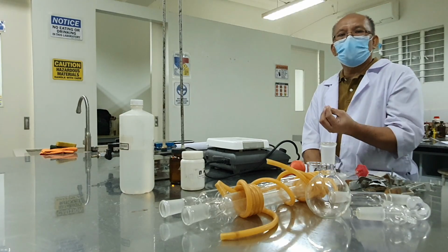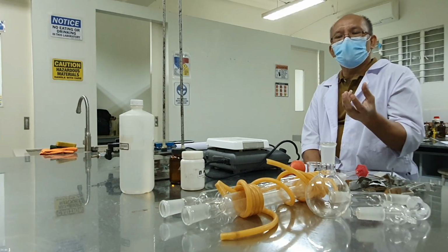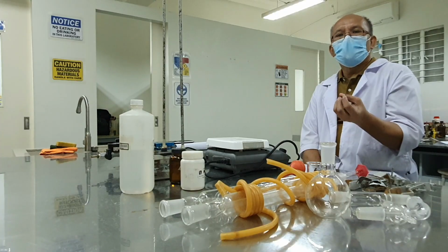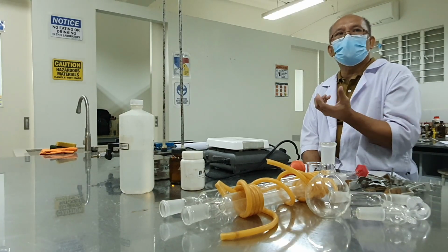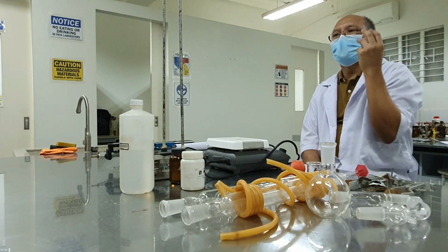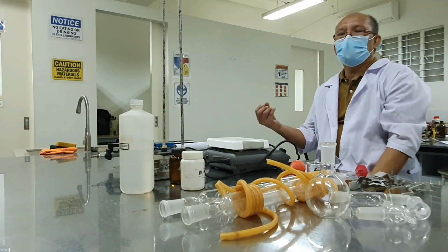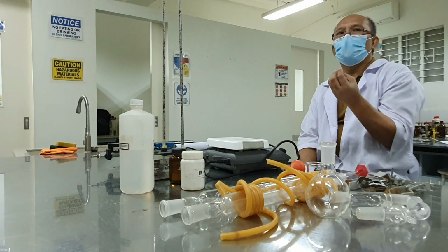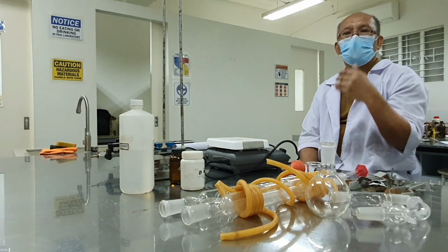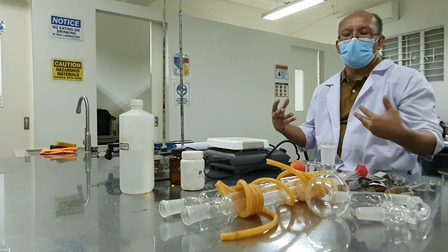So when you heat the mixture, you are evaporating, you are increasing the temperature, so you increase the vapor pressure of the mixture. The lower boiling point will evaporate first, and if you cool it somewhere, that vapor will condense into a liquid, and you collect that. In order for the vapor to become a liquid, we have to lower the temperature, so we use what you call a condenser. The whole setup is what you call the distilling apparatus.